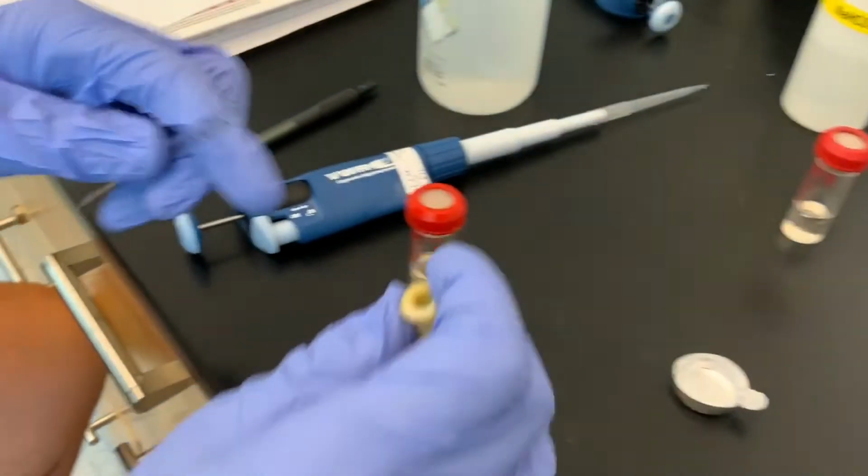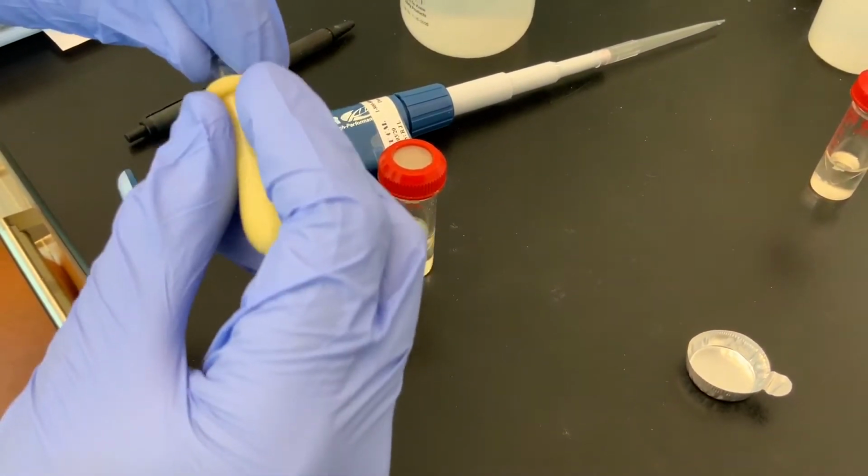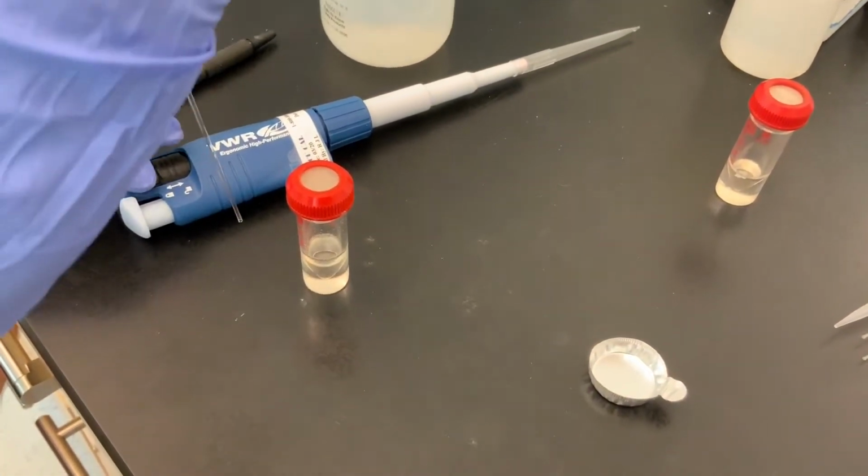And then I'm going to use a 9-inch Pasteur pipette and my Pasteur pipette bulb. Get it on there well. And I'm going to dive down, and I only want the organic layer. The aqueous layer we can save, but we are not interested in it.